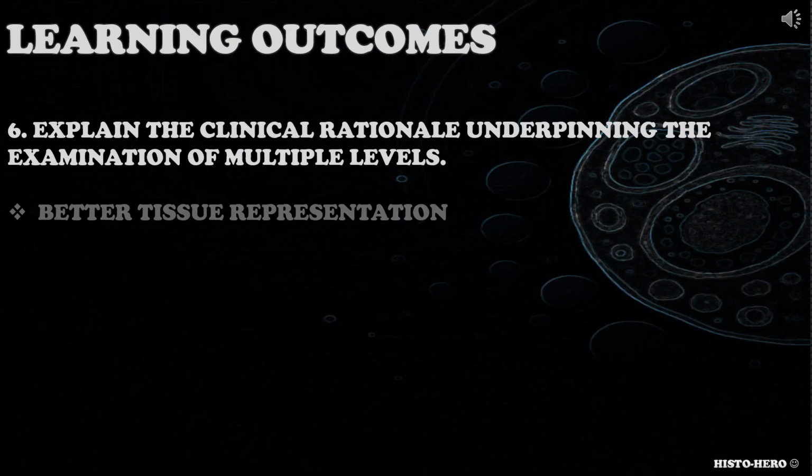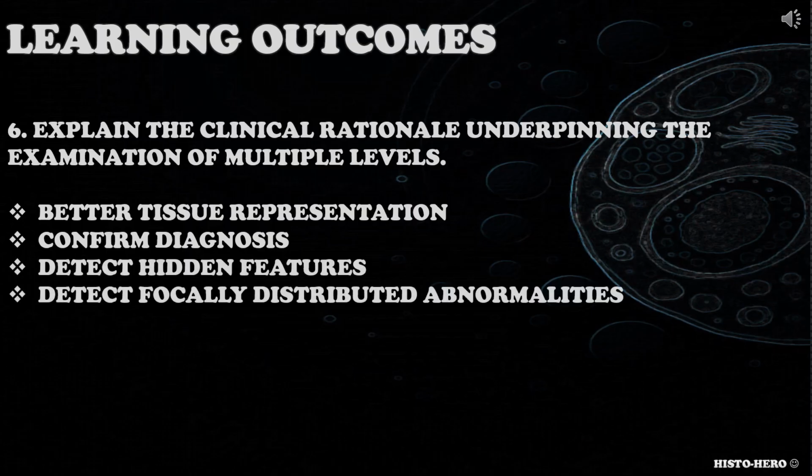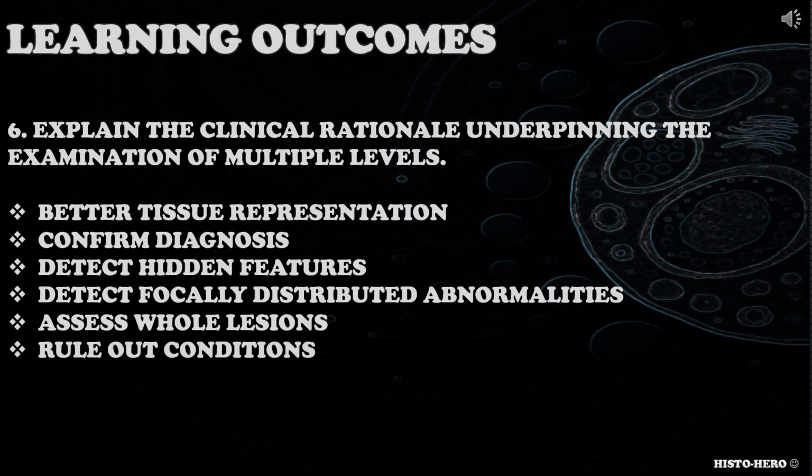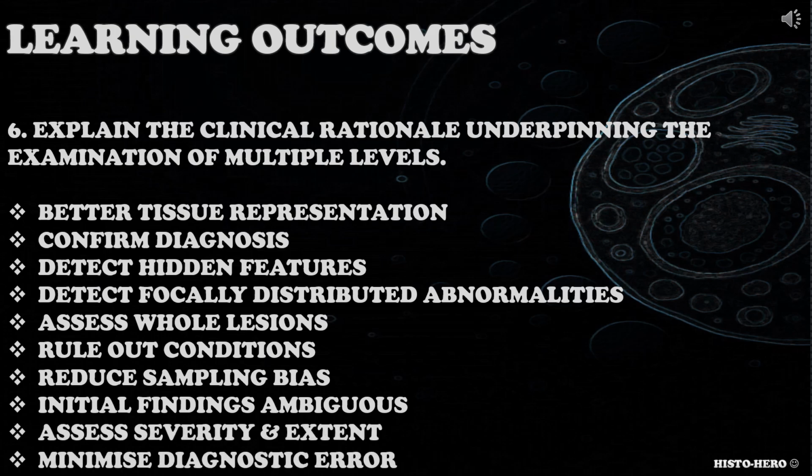Candidate could consider better tissue representation, confirm diagnosis, detect hidden features, detect focally distributed abnormalities, assess the whole lesion, to rule out various conditions, to reduce sampling bias, when the initial findings are ambiguous, to assess severity and extent, to minimize diagnostic error.